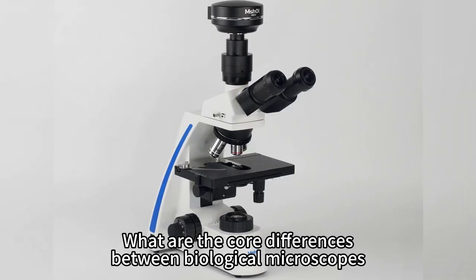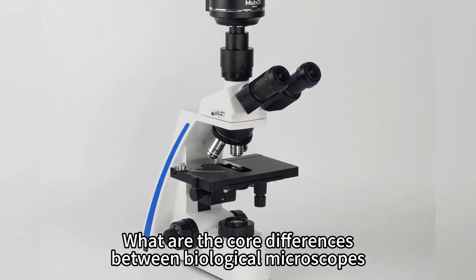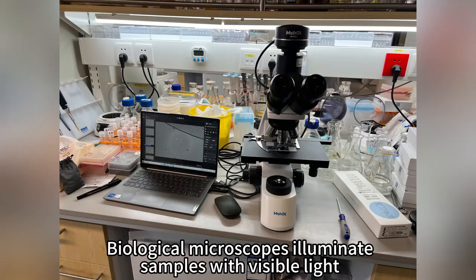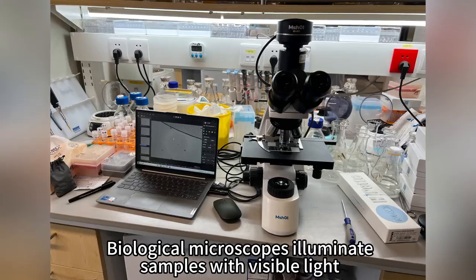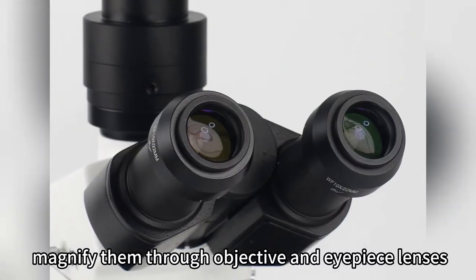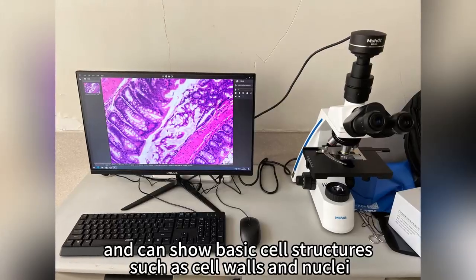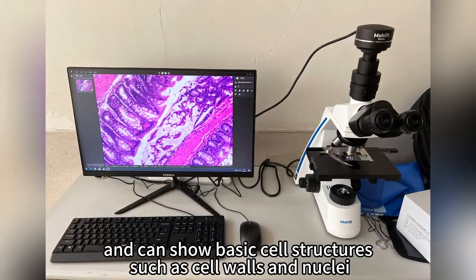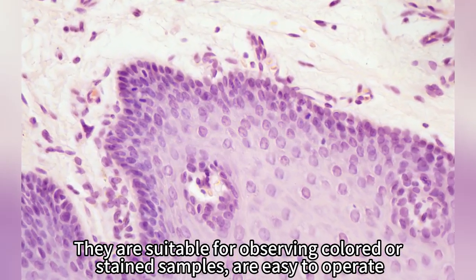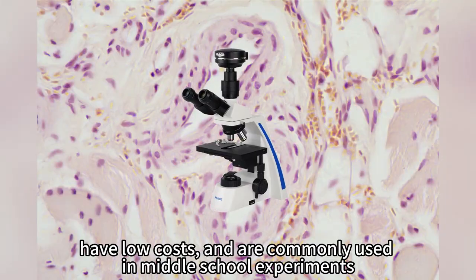What are the core differences between biological microscopes and fluorescence microscopes? You'll know after watching this video. Biological microscopes illuminate samples with visible light, magnify them through objective and eyepiece lenses, and can show basic cell structures such as cell walls and nuclei.